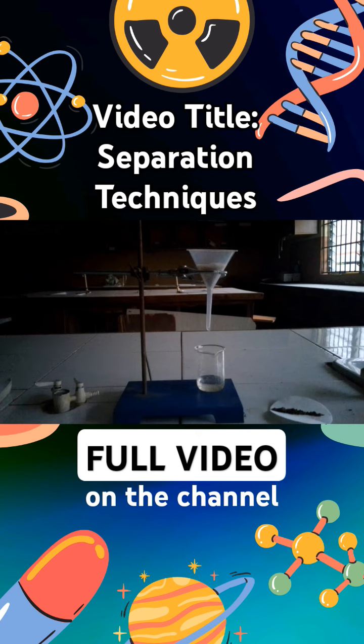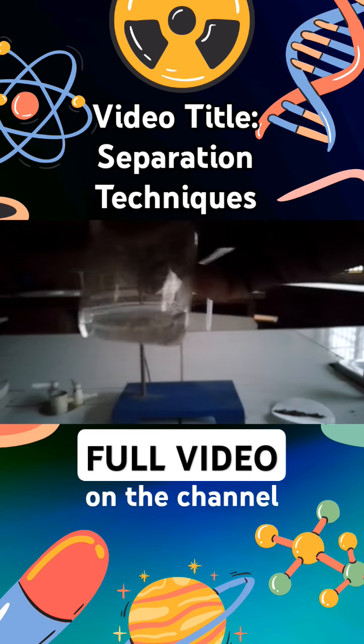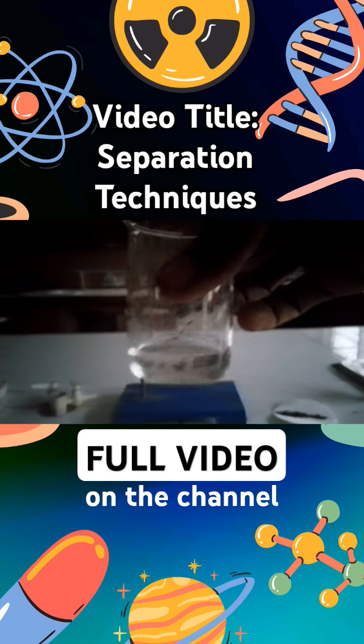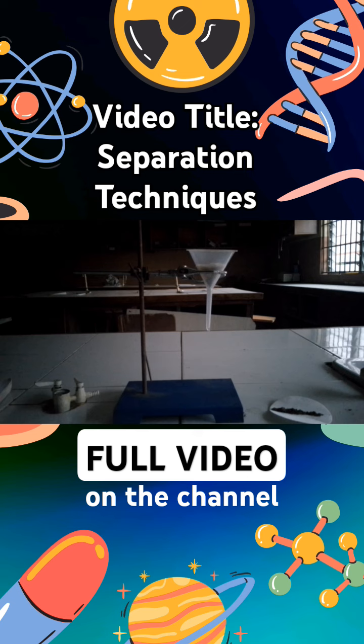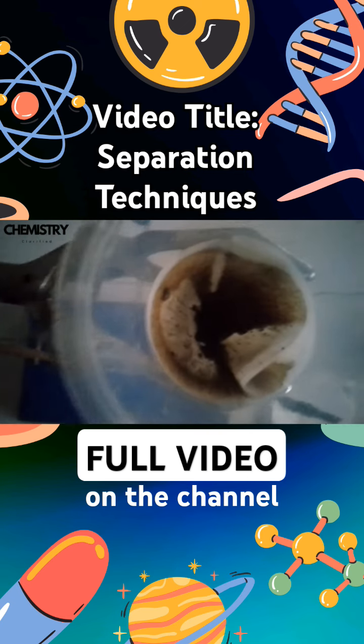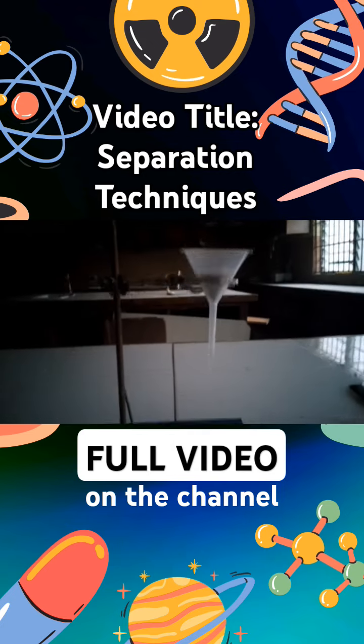Now that we cannot see any water dropping anymore, we can see what we have got. Let's check the water first. As you can see, we started from cloudy water. You can see we are now left with very clean water. So we have separated the water from the sand. And if we take a look inside the funnel with the filter paper, we are going to see the leftover sand. So the sand has been separated from the water. So that is the separation technique using the process of filtration.